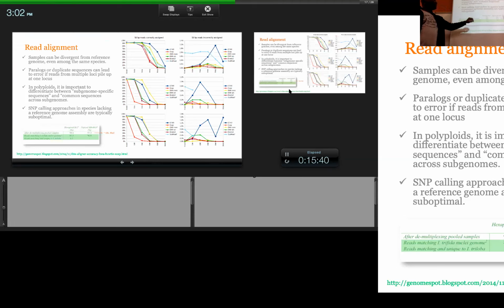At the end of the day, you can also retrieve the proportion of the reads that map to your reference. So in this case, you're seeing about 95% of your sequence reads mapping to the reference, right? But when you make your library, you do spike your library with PhiX. It's a viral genome.